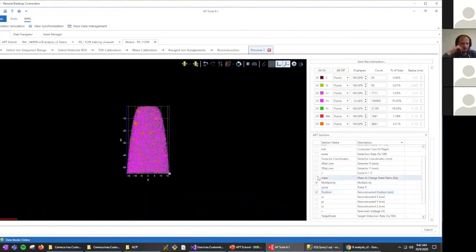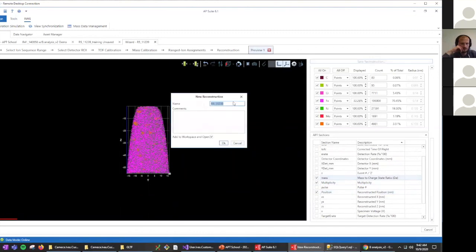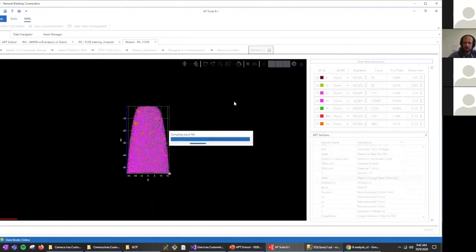Markus, I saw you've switched on your microphone. What are your thoughts on that? Yeah, first of all, I think it went extremely far and is extremely useful for the community. I'm not an experimentalist, so I cannot even say that.